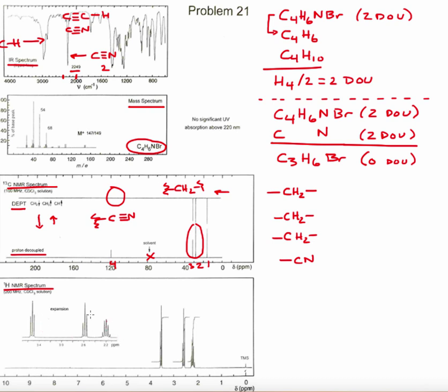Here's an expansion of what we see from two to about three and a half in the proton NMR. First things first, let's recall that this line here is the integration. We have three unique sets of hydrogens. If we look at the expansion, we have a set here, a set there, and a set there. So three unique sets.